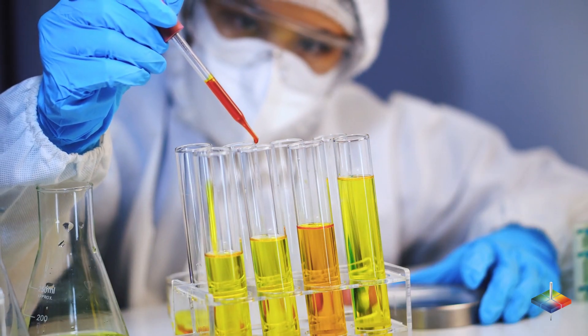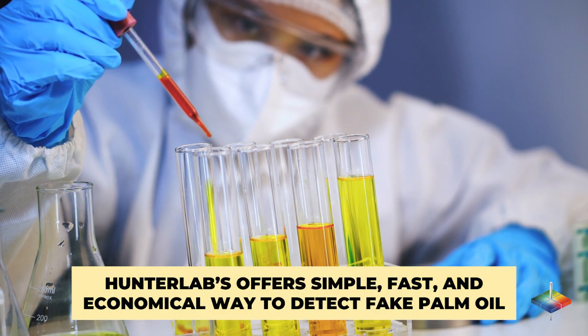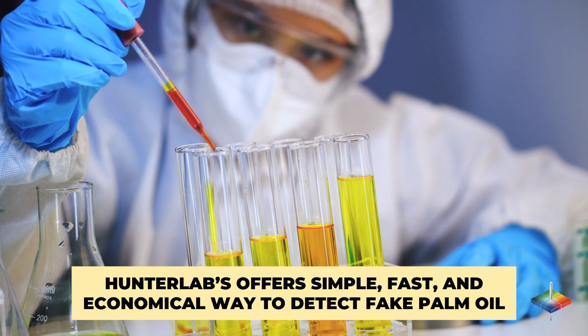Hunter Lab's color measurement solutions offer a simple, fast, and economical way to detect fake palm oil, helping companies maintain and expand market share.